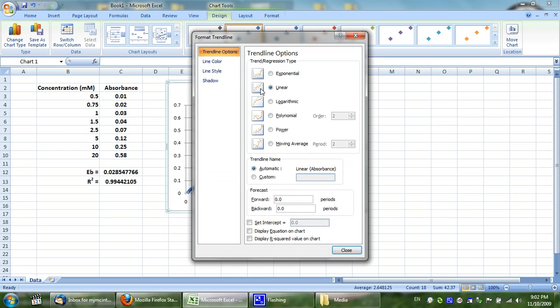It's linear. You don't need to set intercepts — you'll have one data point which is your blank, where zero concentration equals zero absorbance, and that's the reason you wouldn't set an intercept. You want to display the equation and display the R-squared value on the chart, then close.